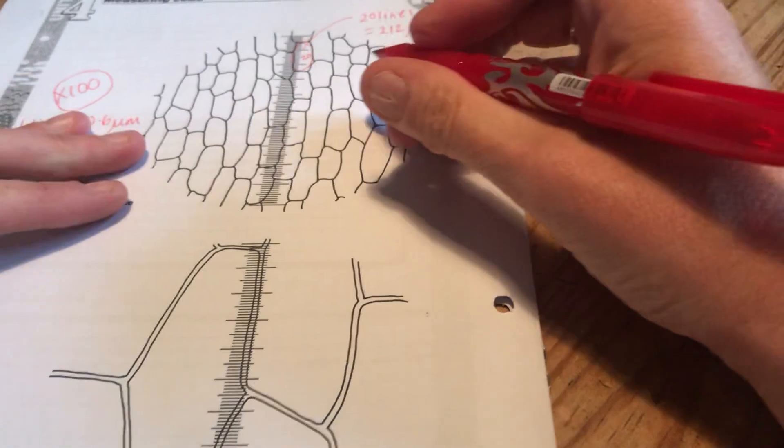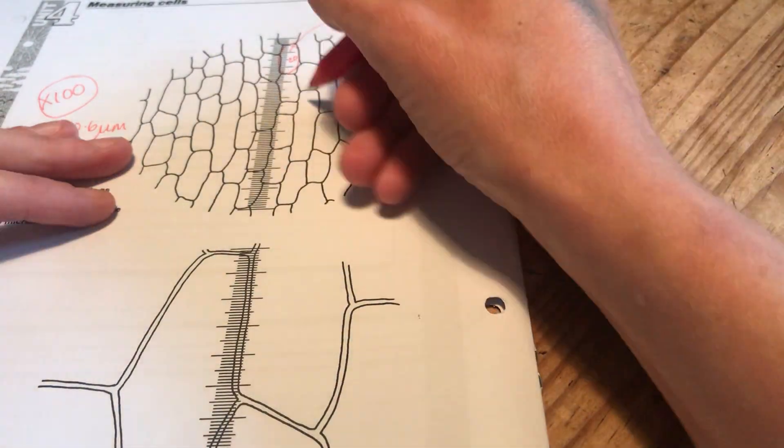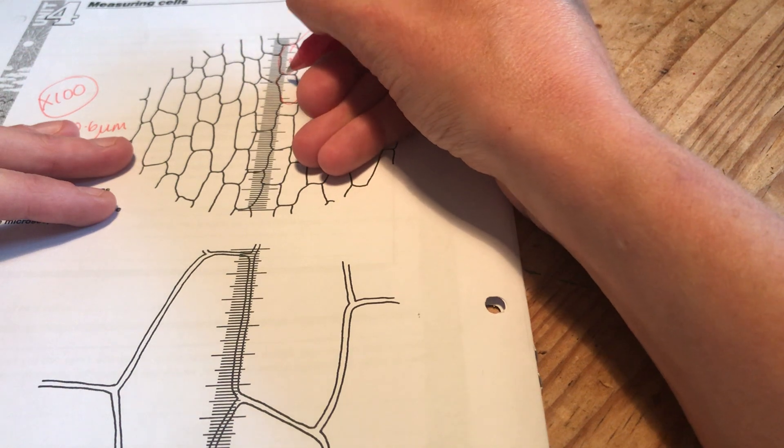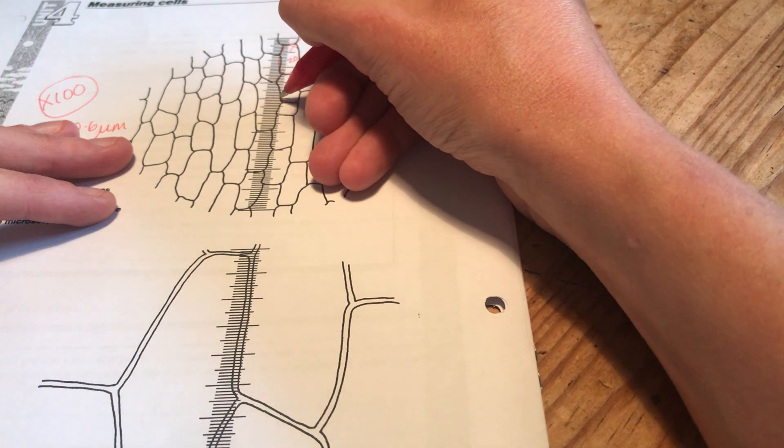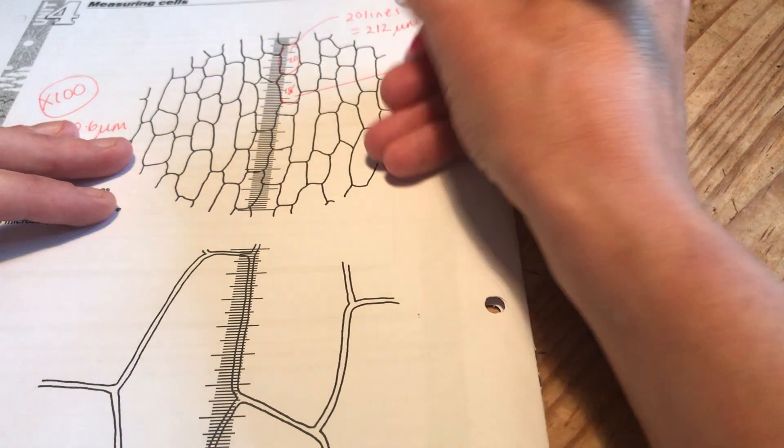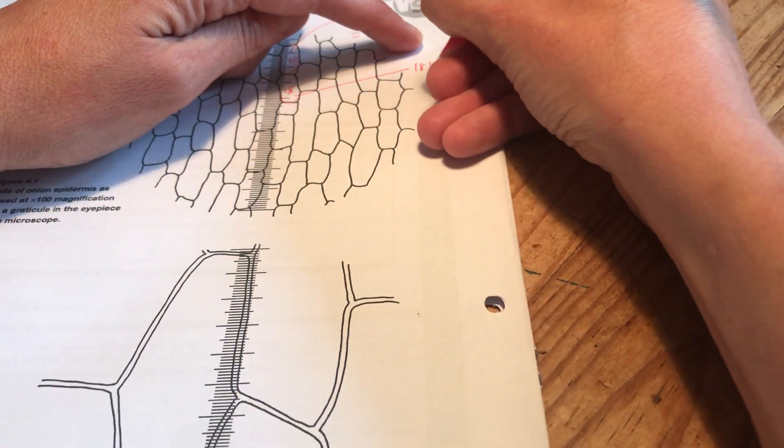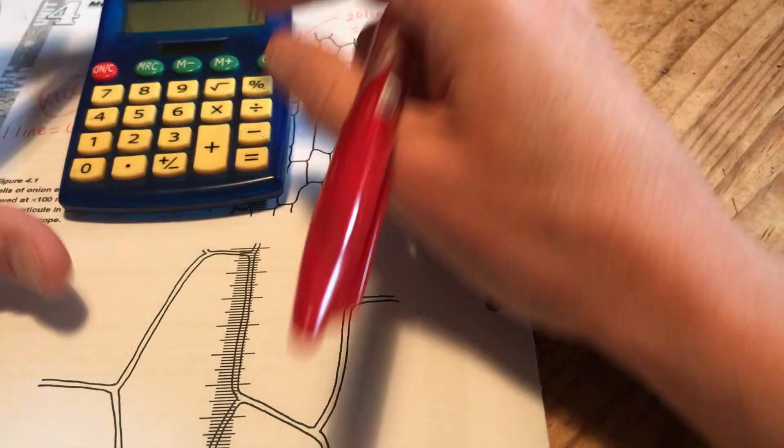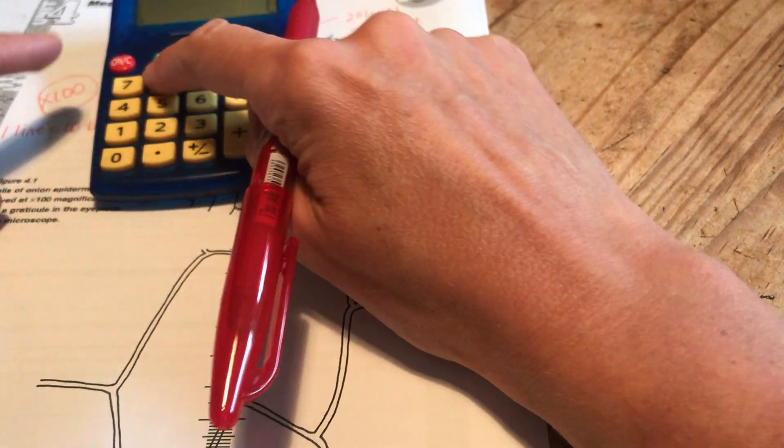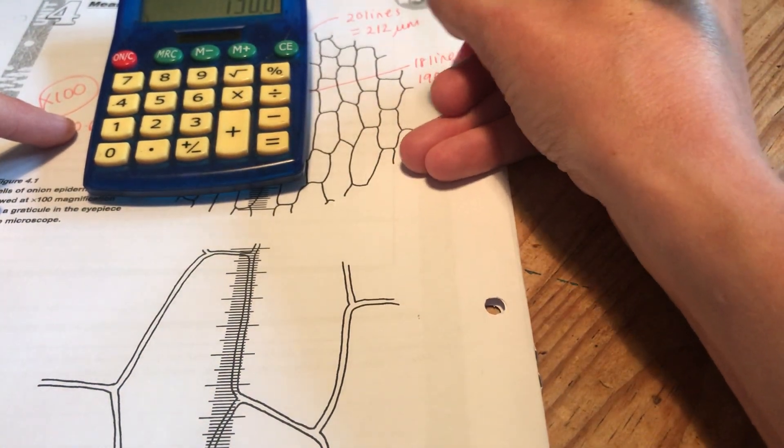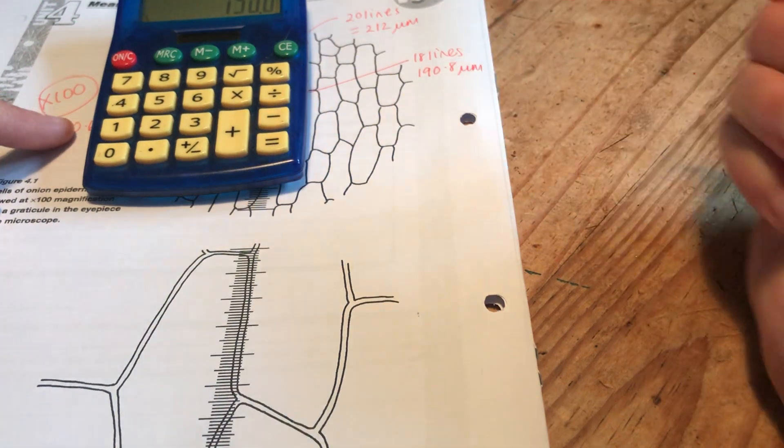I can just do 20 times 10.6 and I could say that cell there is worth 212 micrometers. It wants me to do a mean of a few doesn't it? So we could do the same with this one. This cell here. So that's 5, 10, 15, 16, 17, 18-ish lines. So this cell is 18 lines. I know that each line is worth 10.6. So 10.6 times 18, 190.8 micrometers. That's a slightly shorter one.